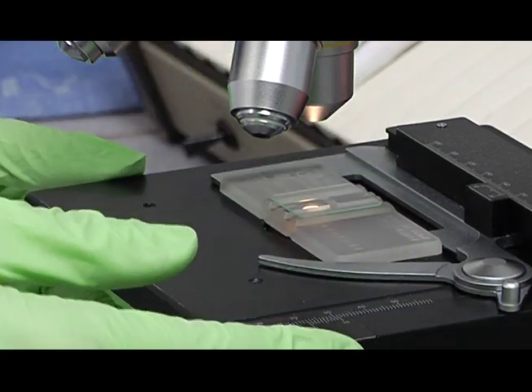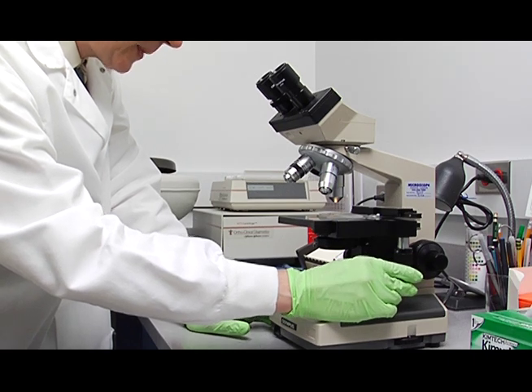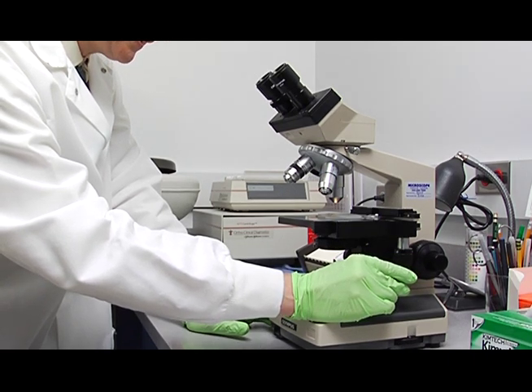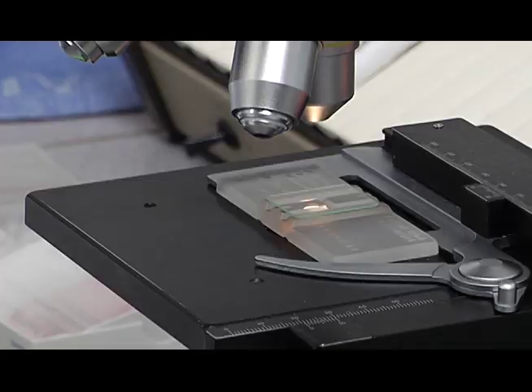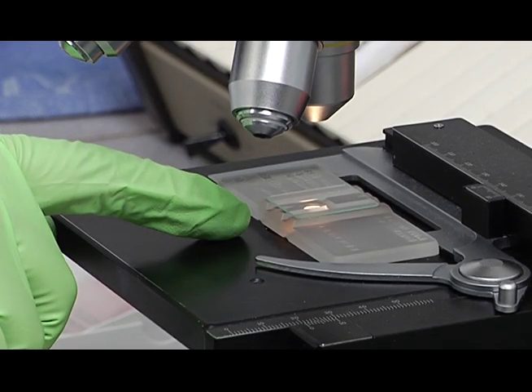Then adjust your stage so that the spot of light is positioned on the hemocytometer. That's where your rulings will show up.